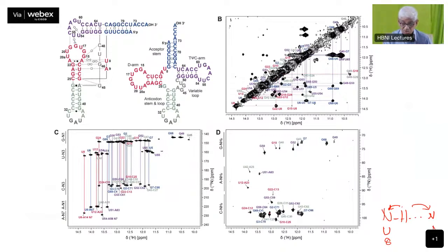And similarly, you see the amino protons. Here, this is the imino proton region once more. Imino proton to the amino proton, this is one hydrogen bond there, right? Then you will see a hydrogen bond; this is the NOE spectrum, N15. In the other hydrogen bond, it will show correlation to the nitrogen of that one. You will see that correlation as well, delta N15 ppm. G24, C12. So this requires quite a complex analysis, and these are the imino correlations. This is imino here, also imino here.